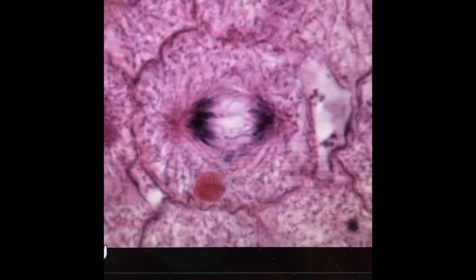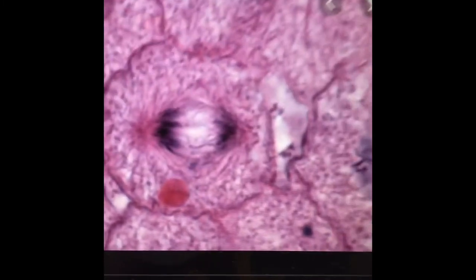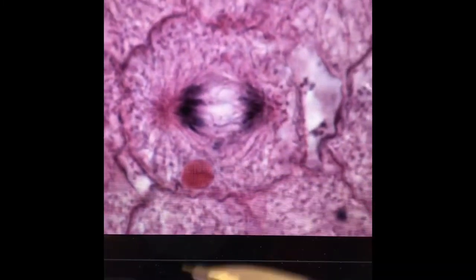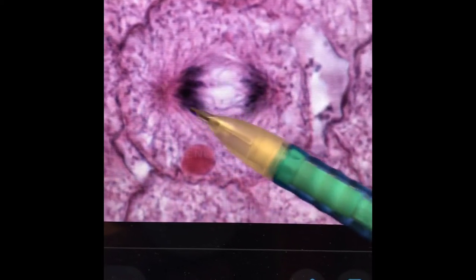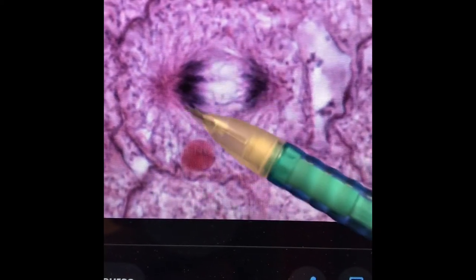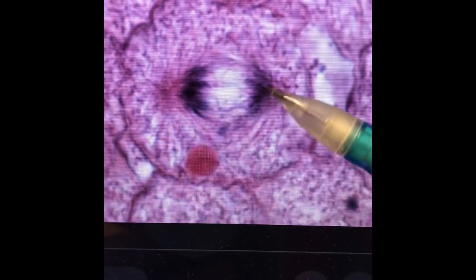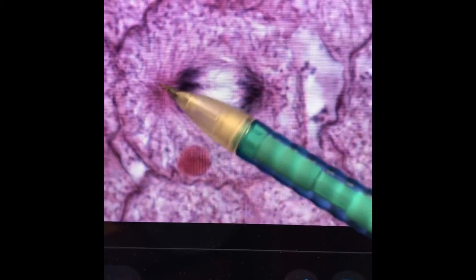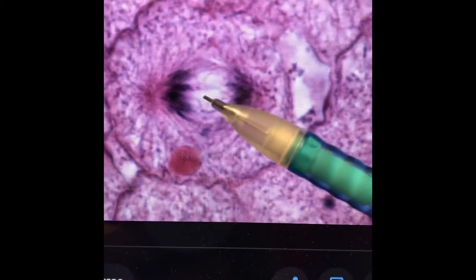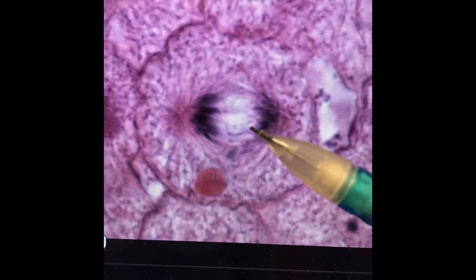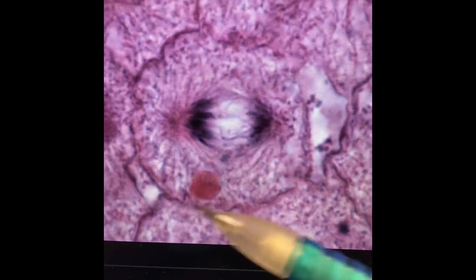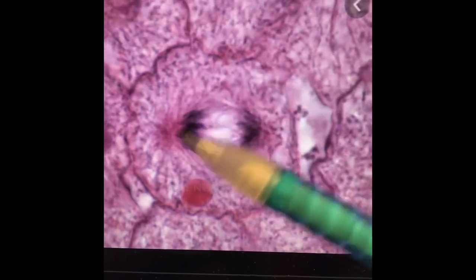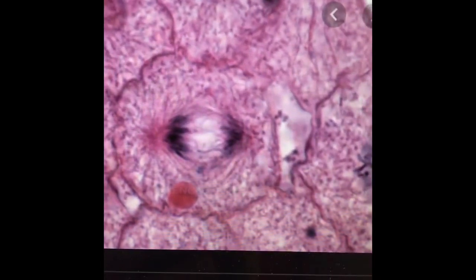That's a really good picture of anaphase. Can you guys see? I'm more concerned with you guys learning the phases than so much of you finding them since you don't have a microscope. So I'm kind of helping you out here. But look at the black that you see right here. That's the DNA. So these are considered to be daughter chromosomes right here. And then these are daughter chromosomes because they're pulled apart from each other. But what I really like in this picture is you see where my pencil is. That's that dark area. That's centrosomes. These are centrosomes. But look at all the white space. Because now the DNA, the daughter chromosomes are being pulled to opposite sides of the cell. And you can see the cell is slightly elongating because it's in that anaphase state. So the destiny of this group of daughter chromosomes and this group of daughter chromosomes is to go to opposite sides to be in the two new nuclei once that happens.